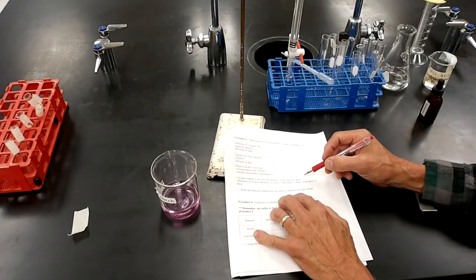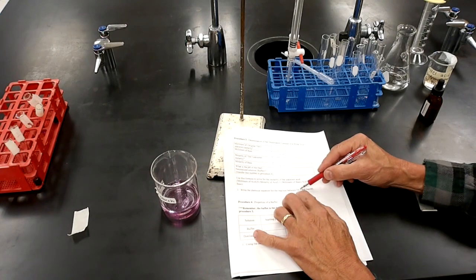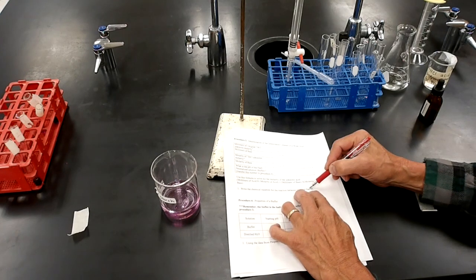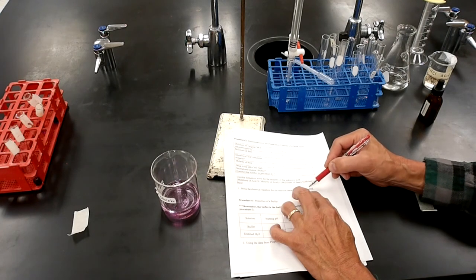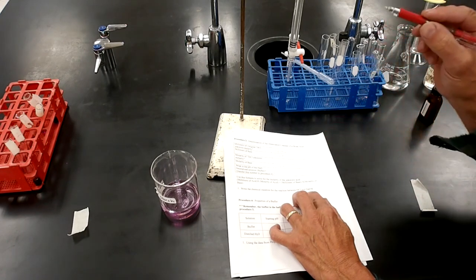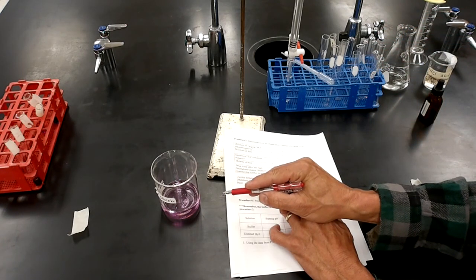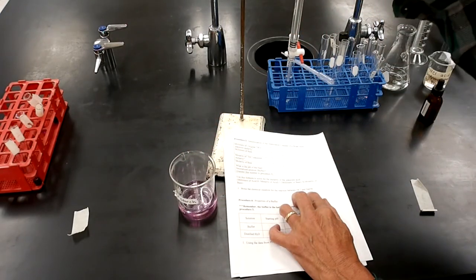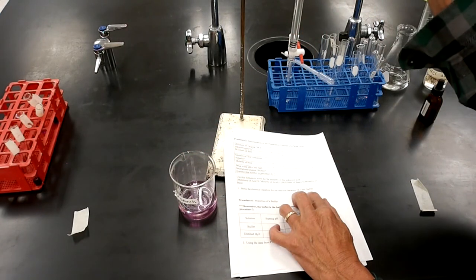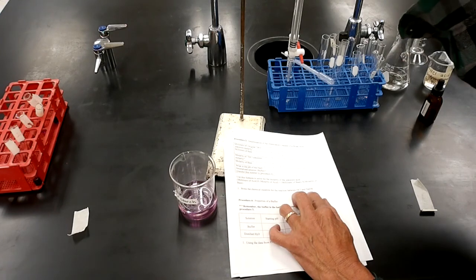So what's happening here? You're basically taking the hydrochloric acid in an unknown solution. You're adding sodium hydroxide. The hydroxide ions will neutralize the hydrogen ions. Basically, they'll combine and turn into water, and you're left with sodium chloride, which is the salt. I don't know how many hydrogen ions were in that unknown, but I know the concentration of hydroxide ions in this solution in the burette, and I know how much I added, 5.4 milliliters.